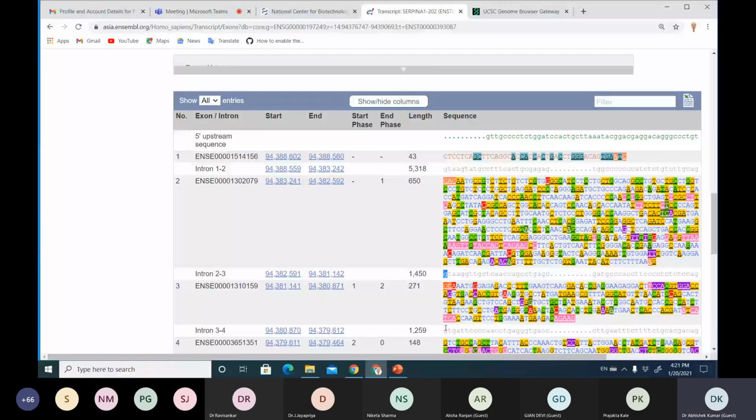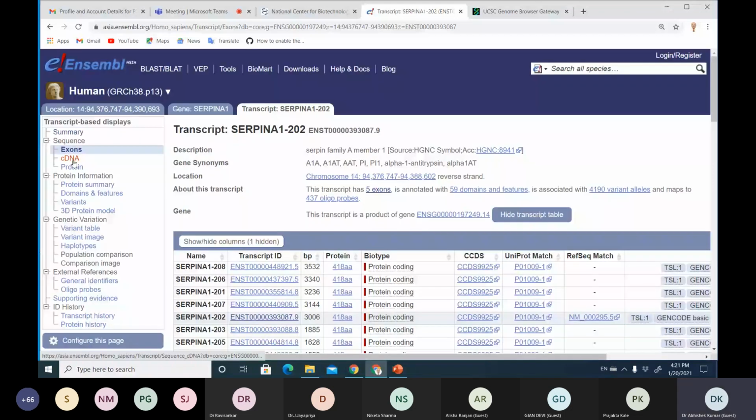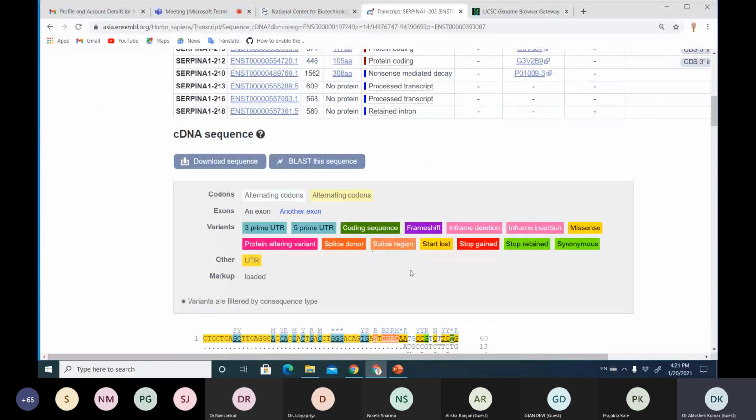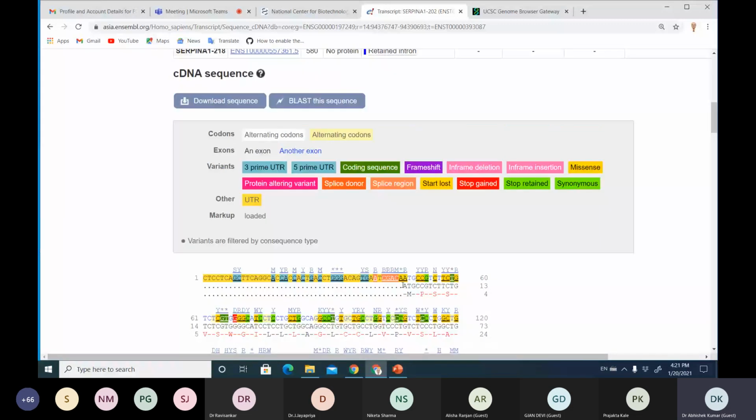So then you say, okay, I see the genomic DNA and cDNA. I want to see the protein sequence mapped to it. That's also possible. You go to the cDNA. So in this, what Ensembl is providing us, the first line is genomic DNA, which is not coding. The first ATG in the cDNA is producing methionine. The first residues are mapped. The second amino acid is coming out of CCG, which is P, then S two times, S, and so on it goes.